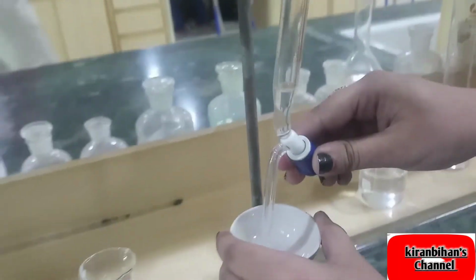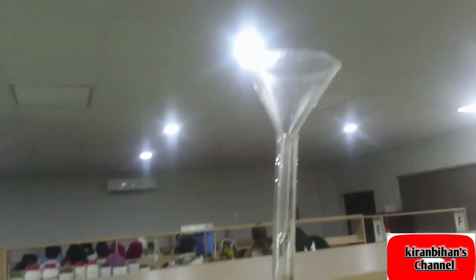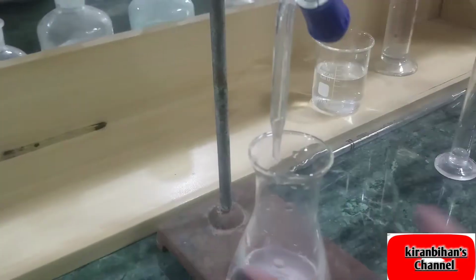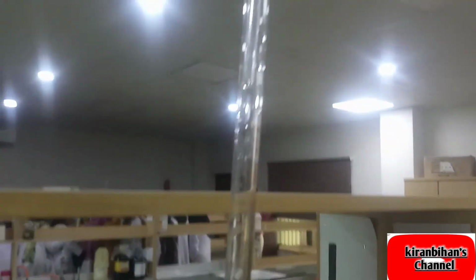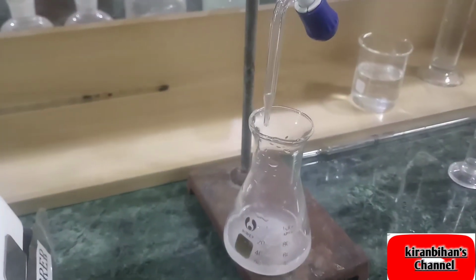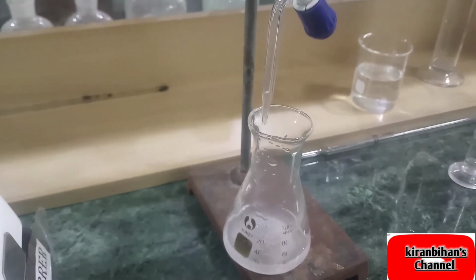Now this is a buret. We will rinse this buret with the help of sodium hydroxide solution this way. Now we'll put the solution under the buret and we will add the sodium hydroxide solution in this buret, 50 ml. This way.